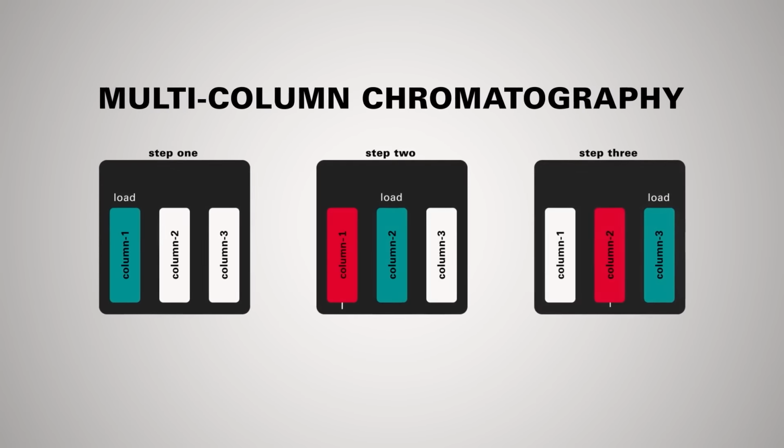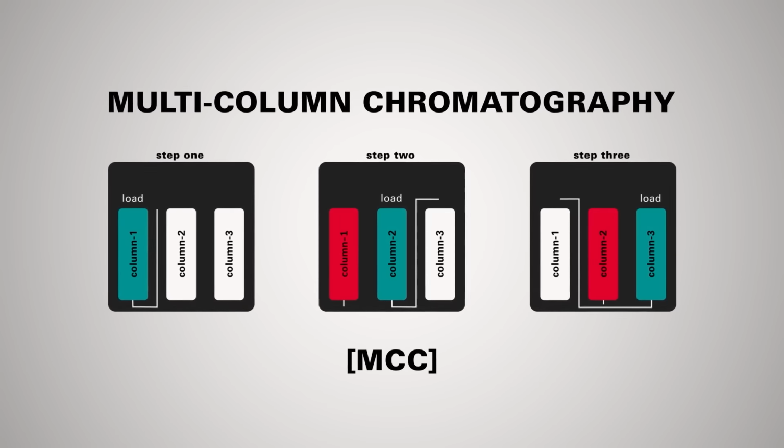And of course, in terms of instrumentation or purification method, people do single columns, like a batch mode, but you will see more and more, instead of doing one column, they do multiple columns. That's why nowadays you can hear that multi-column chromatography or MCC is out there. Even though it's not new anymore, it's been in the market for a few years now, I believe that to reduce cost, to increase production and things like that, more of that will be implemented.